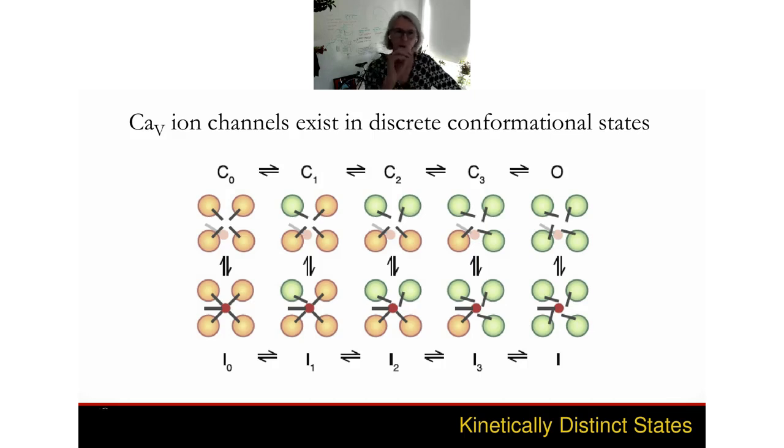So in probing the properties of voltage-gated calcium channels with the students, we're also able to demonstrate that voltage-gated ion channels, and in this case, voltage-gated calcium channels, exist in discrete conformational states that contribute to our understanding of the ionic basis of excitability.